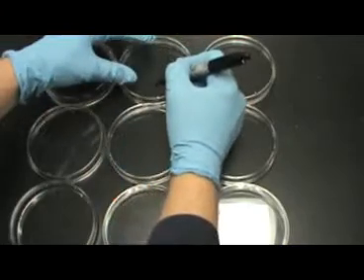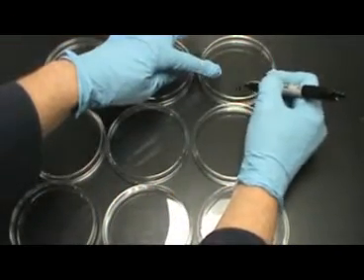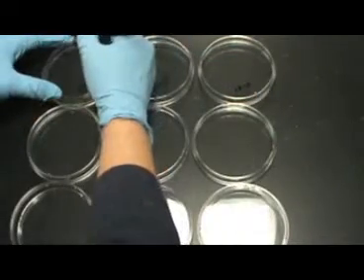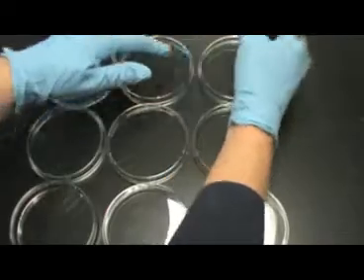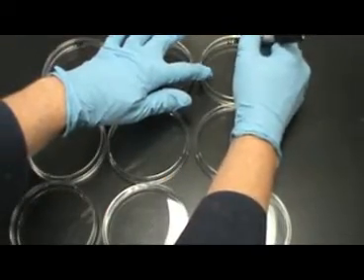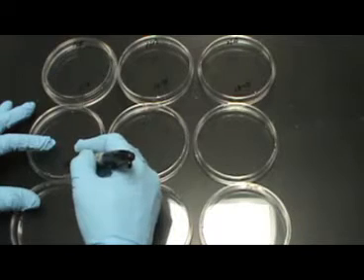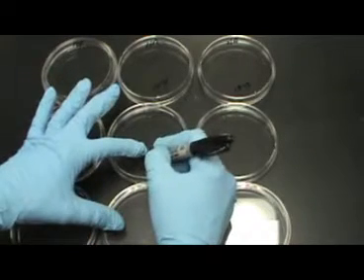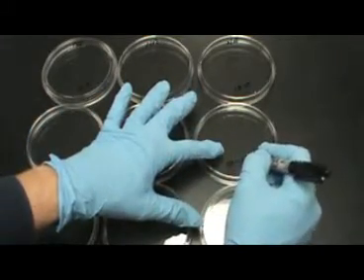You will need 9 plates because there are 3 different dilution factors and 3 different types of media being used. The first row of plates will each contain nutrient agar. You should label the plates from left to right 10 to the negative 2, 10 to the negative 4, and 10 to the negative 5. These will be your final dilution factors.